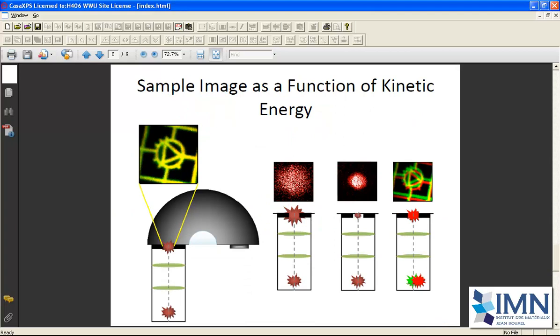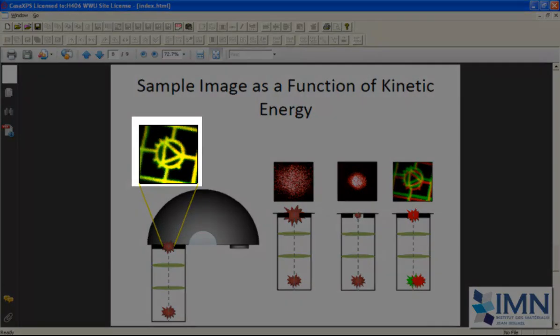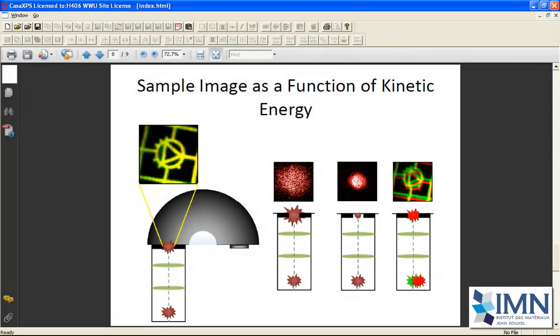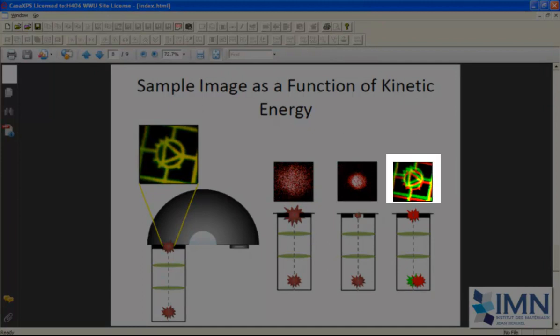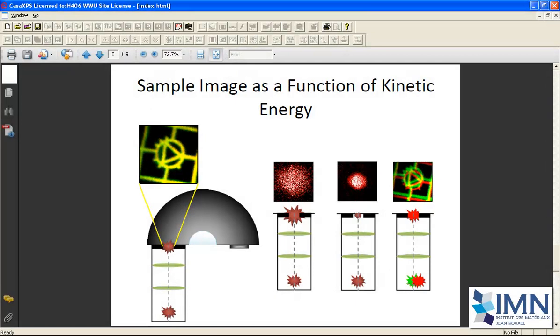There's one further implication of the lens functions that vary as a function of kinetic energy. And that is that if you want to quantify spectra based on peaks at different kinetic energies, then for the quantification to make sense, you ought to have the image of the sample remain constant as a function of kinetic energy. These two images here overlaid at very different kinetic energies, and this is the ideal situation, that they both are the same size and they overlay very well. But it's not necessarily the case, but it is entirely feasible that the sample and the image of the sample that gets passed through to the analyzer may change in its distribution over the detector. You may see these two scenarios occurring, or you may have a shift, and if there's a shift or the area that's being analyzed changes in any way, then this will have a consequence for the quantification of XPS spectra.